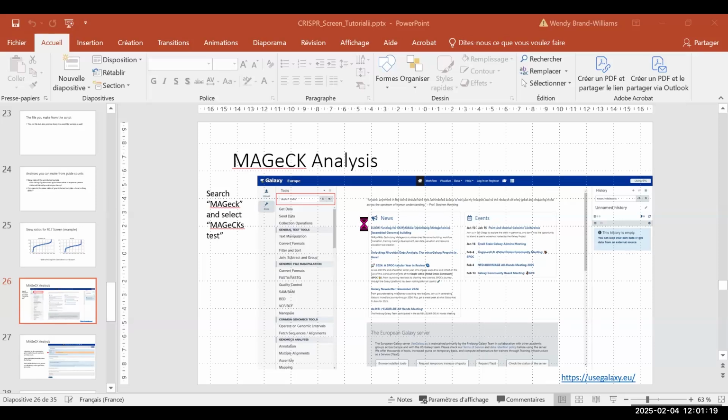Okay. You guys seeing a column on the left with all the guide sequences followed by the gene name, and then a number of columns that have numbers ranging from 1 to... Yep. So essentially, what this is, if you look at the very top row, target ZZZ3, obviously in alphabetical.